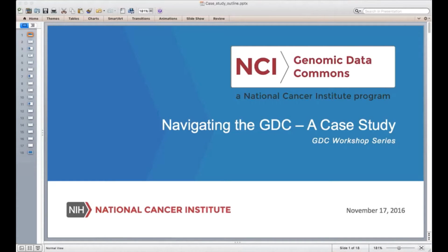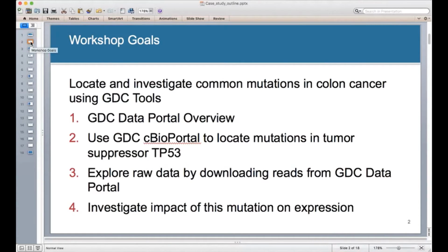Okay, so what are we going to cover specifically today? The goal here is to introduce everybody to the GDC and some of the data it contains and how to access it. And in order to do that, what we're going to do today is investigate some common mutations in colon cancer using the GDC tools.